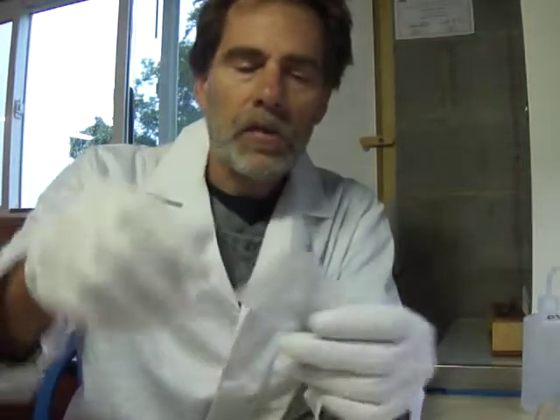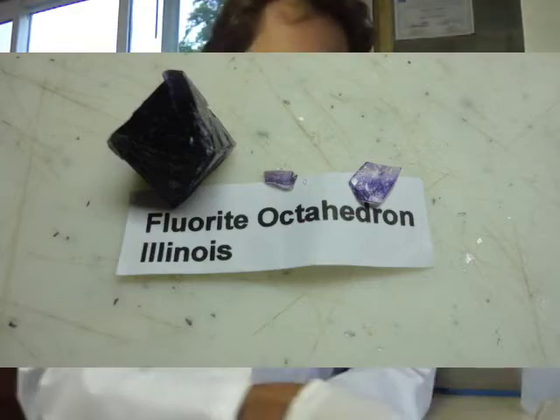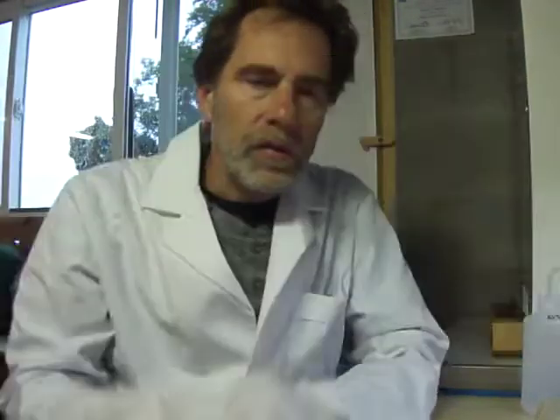I have some concentrated sulfuric acid, and I also have some fluorite that I actually powdered up. Just to give you a warning — this is not a how-to video. I do not recommend doing this because hydrofluoric acid is really dangerous, and heating concentrated sulfuric acid is obviously very dangerous too. So this is not a how-to video — if you don't know what you're doing, obviously don't try it.